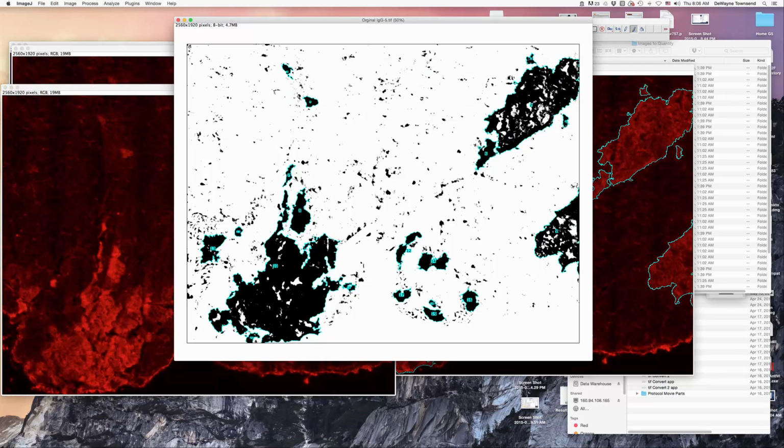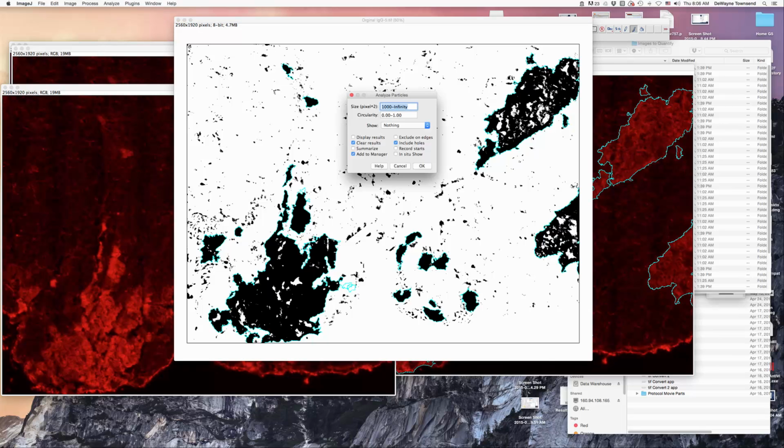Okay, so then I got to erase this guy here, which we decided was going to be negative. Kind of clean up the edges a little bit. These little outcroppings are rarely positive. Okay, so I think now let's just do one last run through here, see how we're doing.